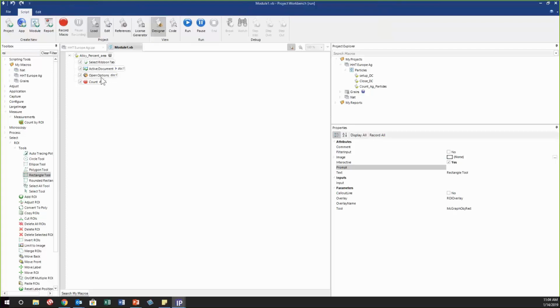In this case, smart segmentation, what parameters I want to measure. And if I have any filtering going on to remove particles that are not what I want to measure, either by size or any other property that's available within Image Pro. And how I have my display, do I want to show the objects filled or outlined, or do I want to put the object number display or the actual measurement value on. And that all gets saved in that measurement options file, that .iqo file.